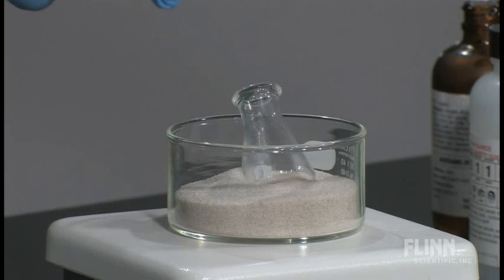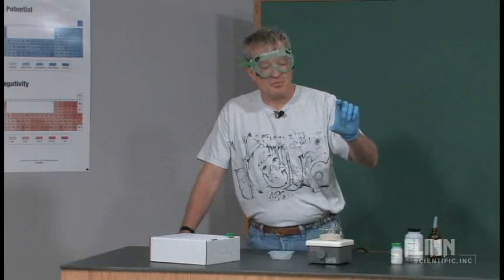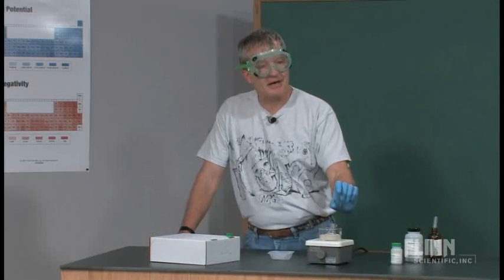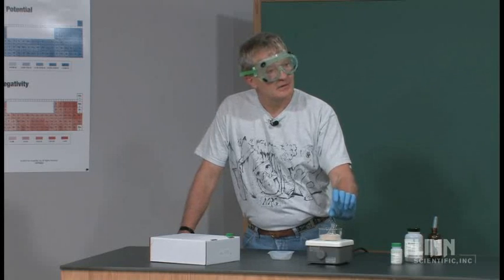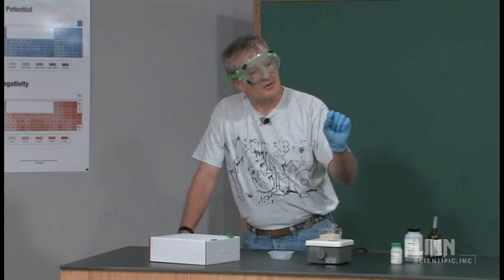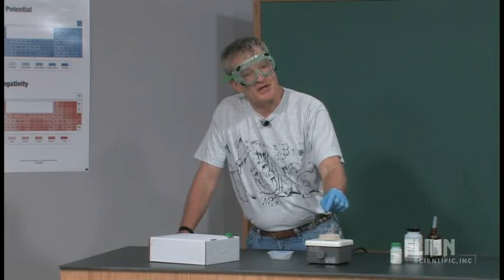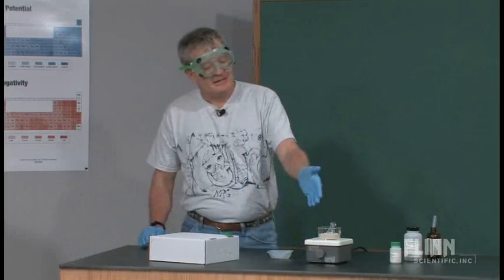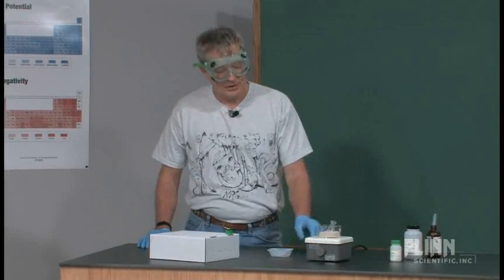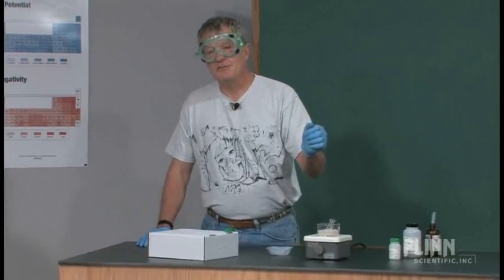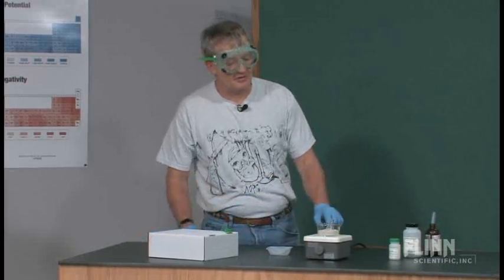I didn't have a lot of these 10-milliliter Erlenmeyers. I used test tubes. A 13 by 100 or a small test tube works just as well. Your sand bath needs to be a little deeper, so you just have a deeper container for it and then you can slide that thing down in the sand bath and heat it. It takes maybe 10-15 minutes maximum to drive off all of that solid.